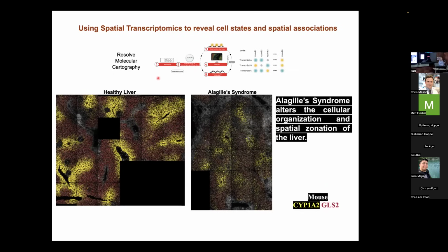And I have to say, the technology that we're using here is only limited to 100 markers. So we really were not able to dig deep into this, but with the advent of the next technology, which I'll have exactly probably 5 minutes to talk about, that technology will allow us to delineate the cell type. But using the single cell RNA-seq data, we were able to develop very specific, maybe 2 or 3 RNAs to at least delineate each cell type that we were interested in. But again, we don't have enough room for signaling or crosstalk or any of these things.